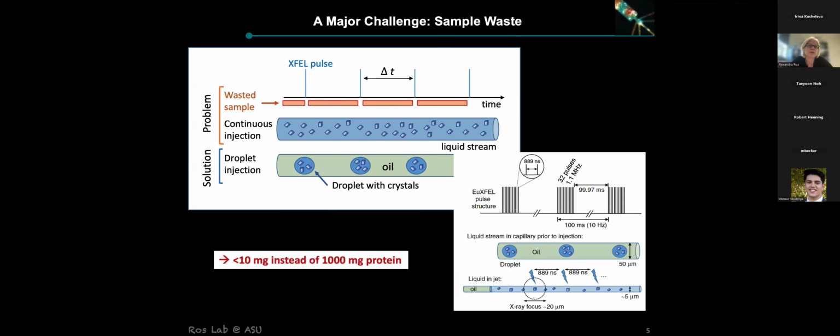And the proposition that we made a few years ago was to segment crystals in droplets separated through an immiscible oil, as shown in this slide. It's contrasted with the continuous injection, and you see, any time the laser is off, we would basically waste material in these experiments.